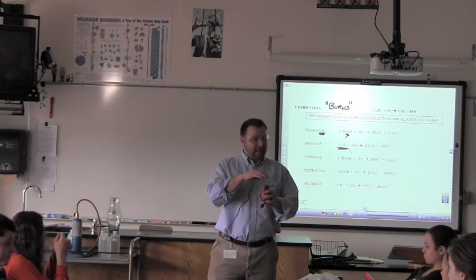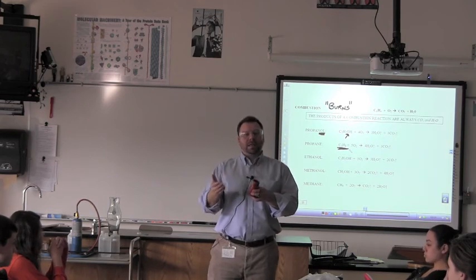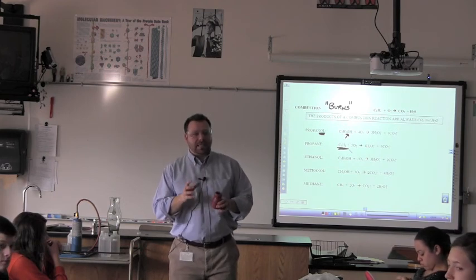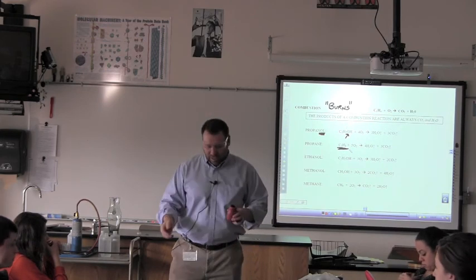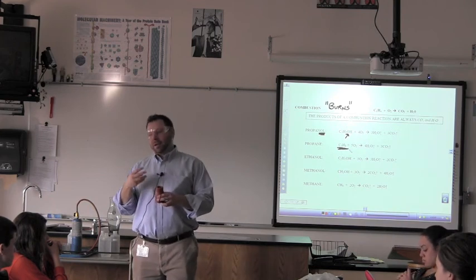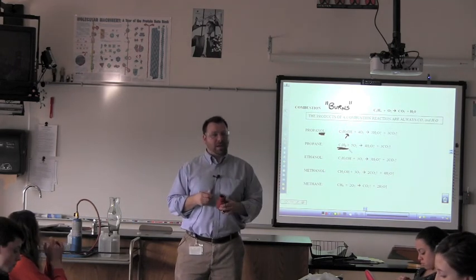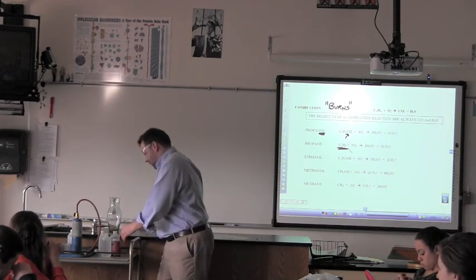Because what had happened is that it produced carbon dioxide within the bulb here. And so because there wasn't as much oxygen, the reaction didn't happen as quickly or as much as it did before. In that case, oxygen is the limiting factor. Now think about that. If you're driving a car and you have a clogged air filter, what's going to happen? You're going to have worse gas mileage, right? And that's because you have to get enough oxygen in to make the reaction happen at a better, more efficient rate. So there is your ethanol.